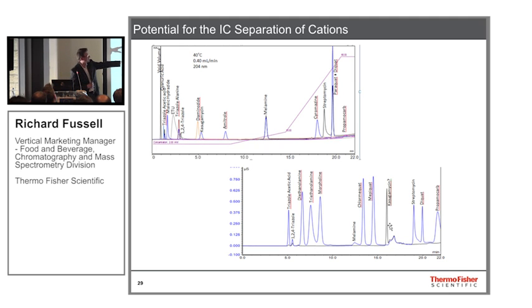You can see that we've got paraquat and diquat here co-eluting. And I know that these compounds, as I said before, need a different method of extraction, because you need a higher acid concentration to be able to extract these effectively, to extract incurred residues. So we did a European study with the EURL laboratory, where we produced incurred residues, just to test that method. But this is just to show that you can get really reasonable peak shapes, even though these compounds co-elute.